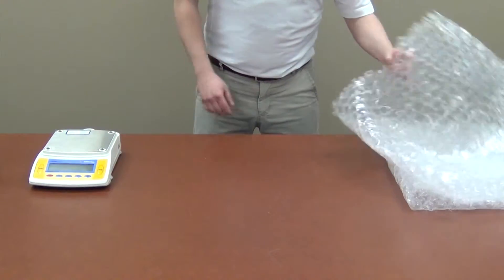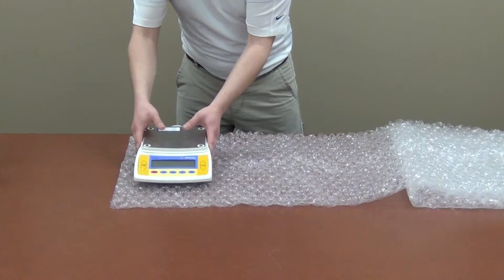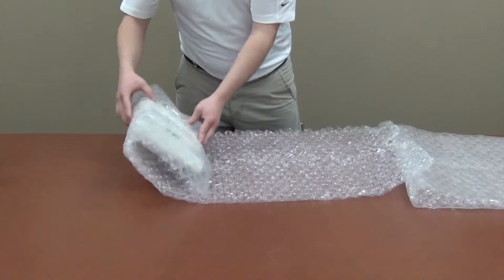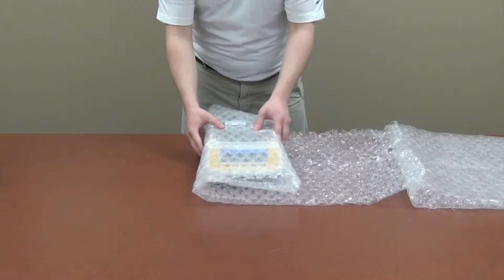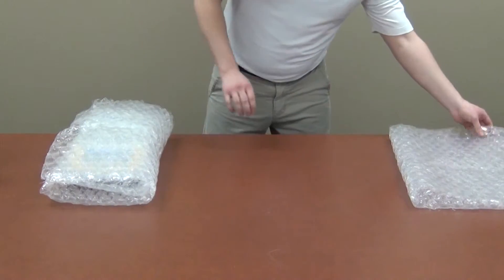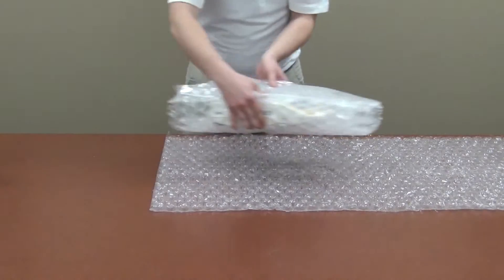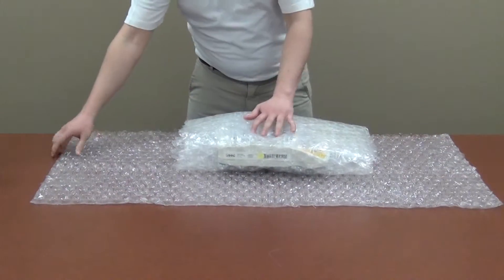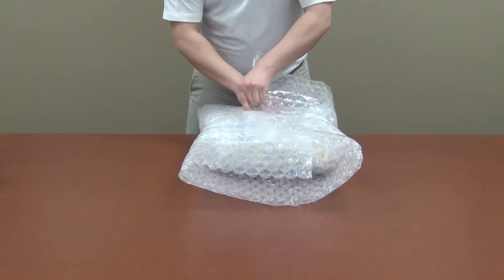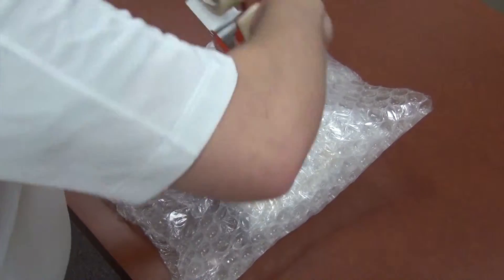To pack the scale, place it on a piece of large bubble wrap. Wrap the scale in one direction. Secure the bubble wrap with as much tape as necessary.